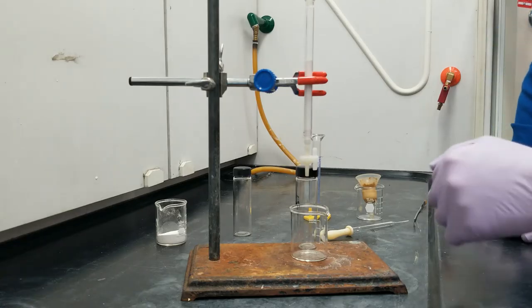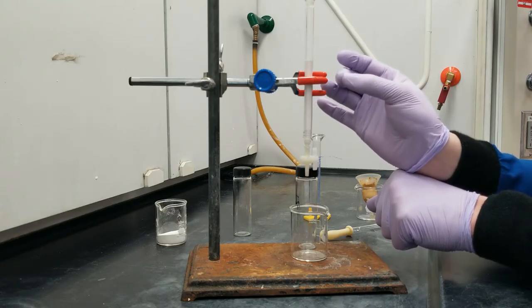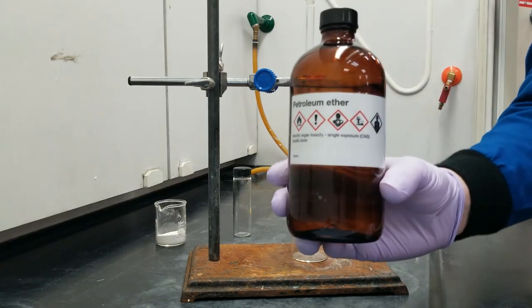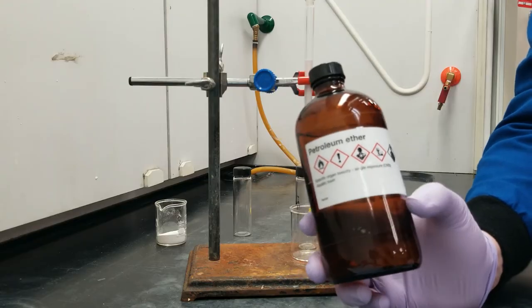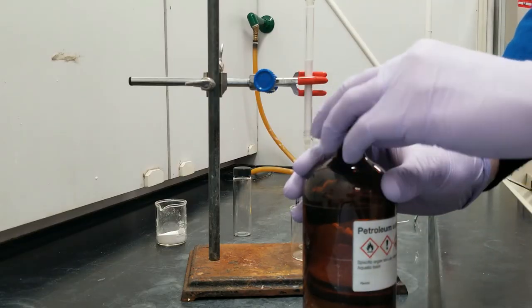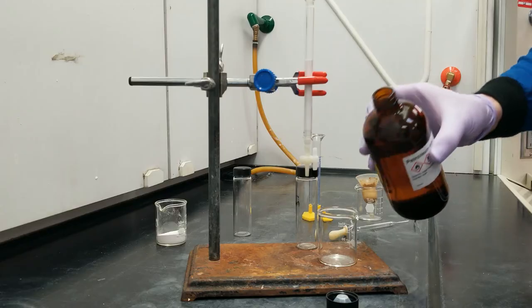So when setting this up, the enemy to a good column is actually air bubbles. We're going to wet this down really quickly, and I'll get a little further into that. So here is petroleum ether. This is a really non-polar solvent. It's an oxygen with long, long carbon chains coming off of each end of it. This is going to be great at driving out the ferrocene, which is really nonpolar, but it's not going to have much of an effect on the acetyl ferrocene, which is more polar.